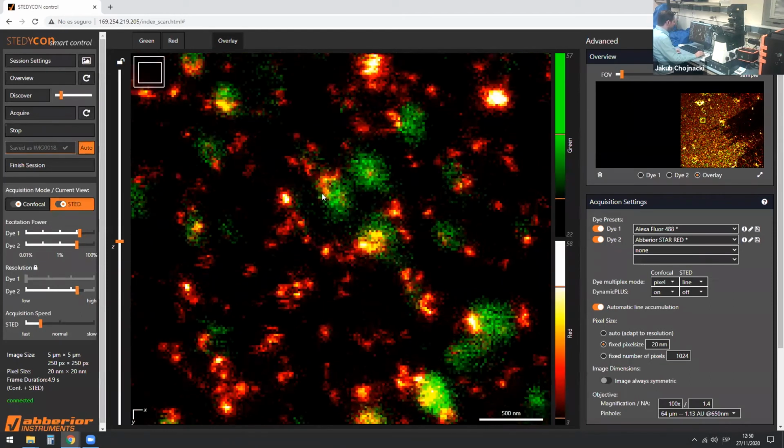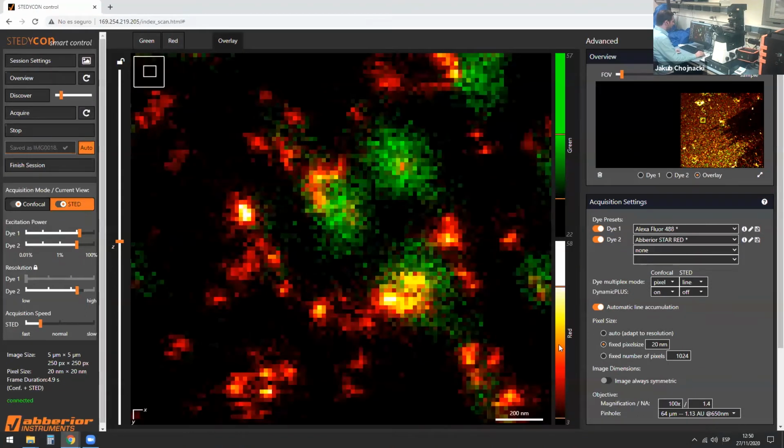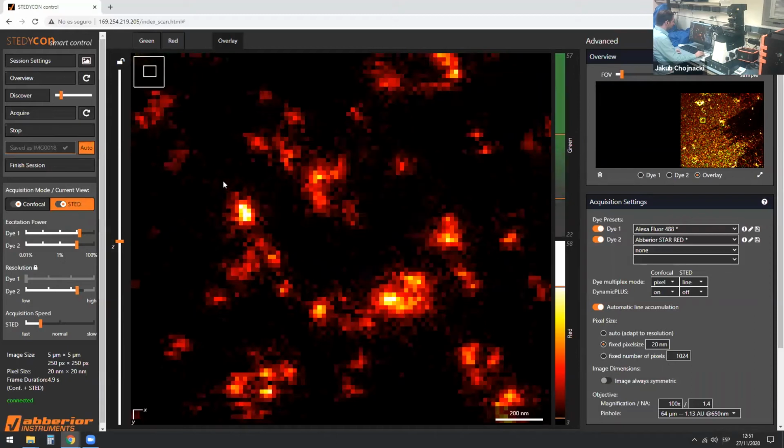Okay, for example, I think there was another virus particle here. I think maybe there's two of them here. But what I can see here is a bit of a semicircle. And the semicircle indicates that those proteins are a little bit more spread out all over the virus surface. I think there is a bit of a semicircle here and another small faint signal over here.